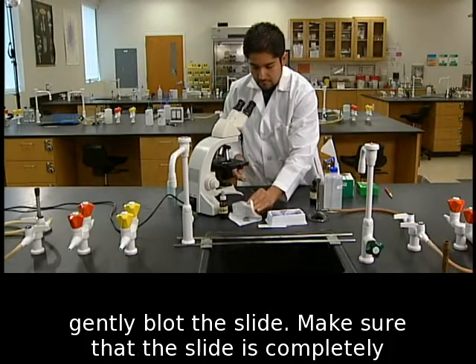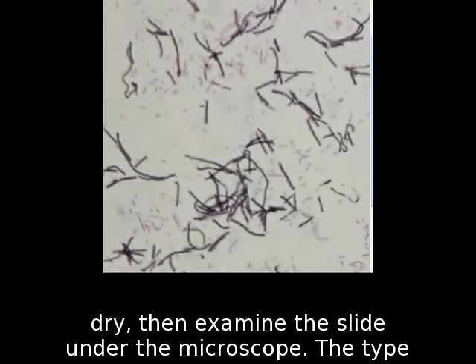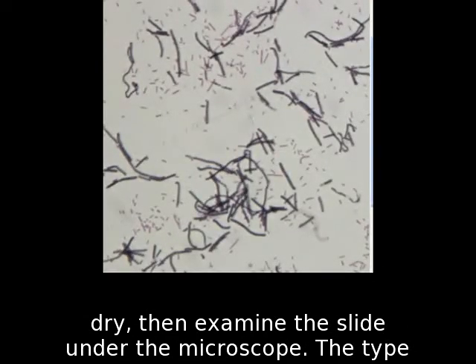Do not wipe, just gently blot the slide. Make sure that the slide is completely dry, then examine the slide under the microscope.